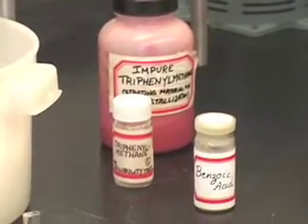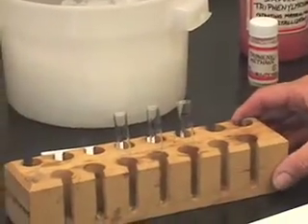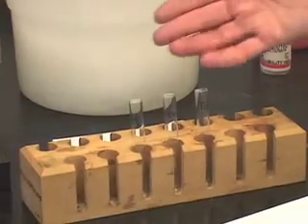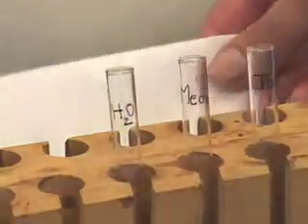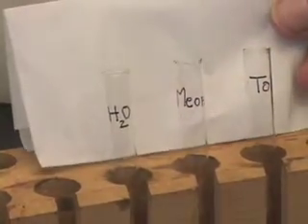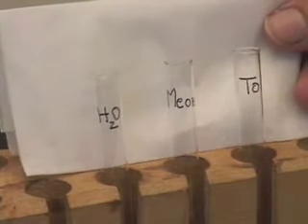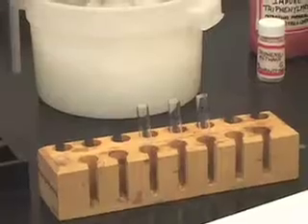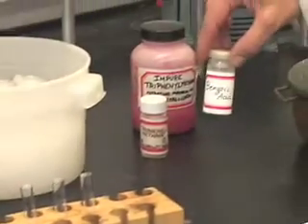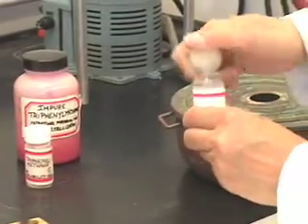How do we do the solubility test? You take different test tubes. Notice that I have taken 3 test tubes here. I have also labeled these test tubes with the respective solvents. The first one I have labeled as water, the second one methanol and the third one as toluene. So, let us take benzoic acid in these 3 test tubes and check the solubility.